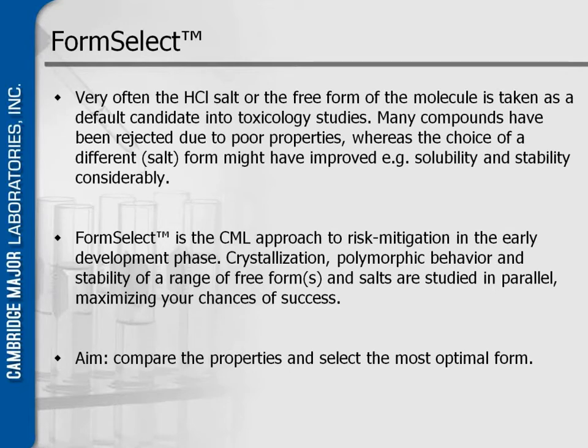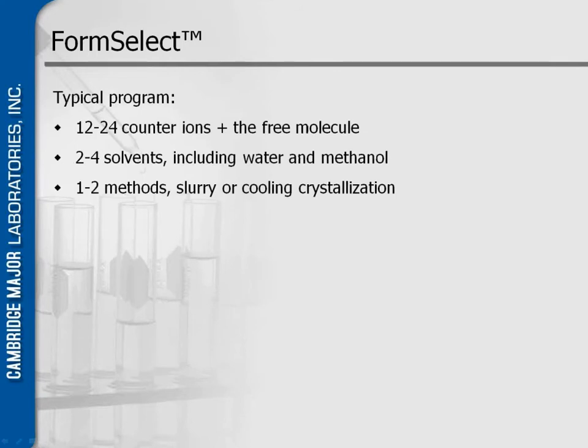I will show a typical program. When you look at the possibility to form any salts, it is about 12 to 24 counterions and the free molecule itself, and 2 to 4 solvents, including water and methanol. Water is very important here because everything turns on the aqueous solubility.